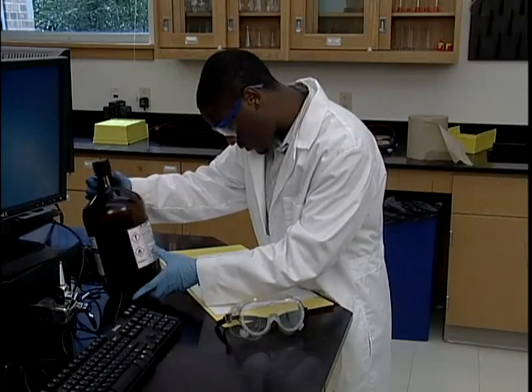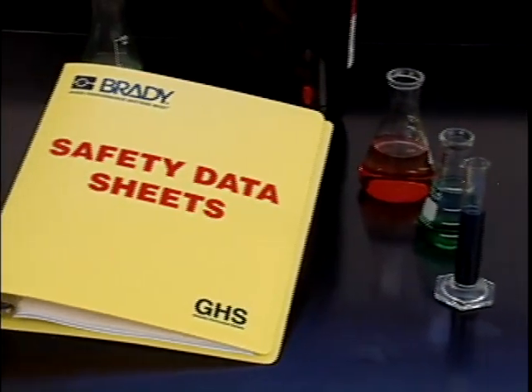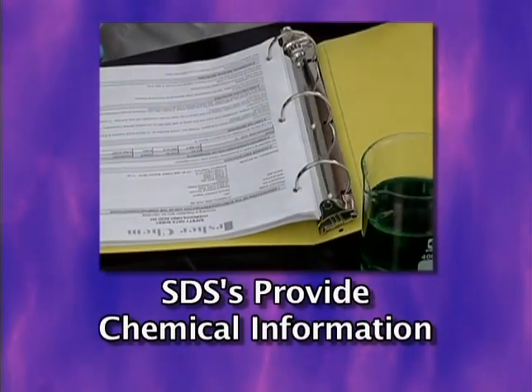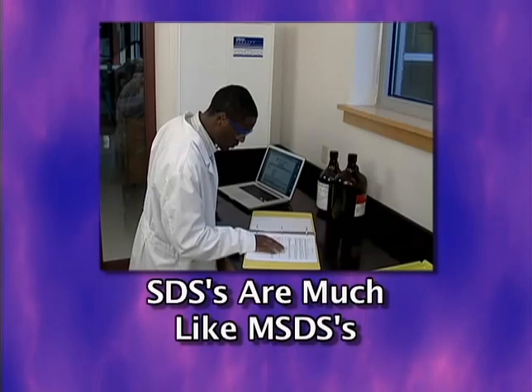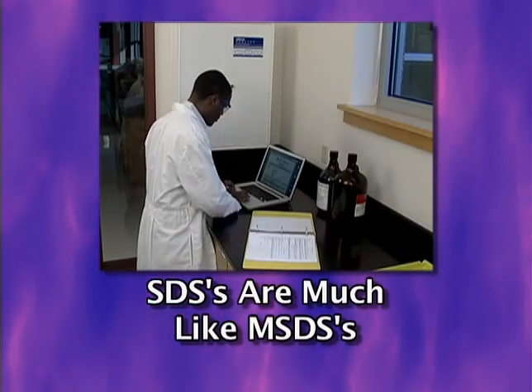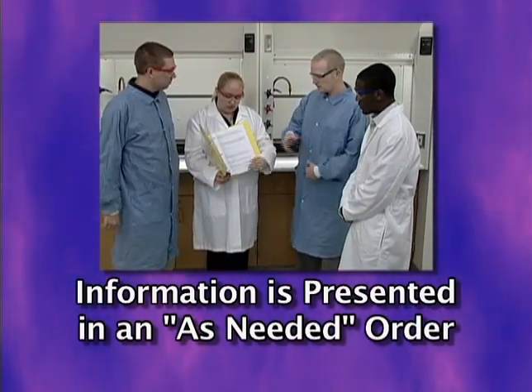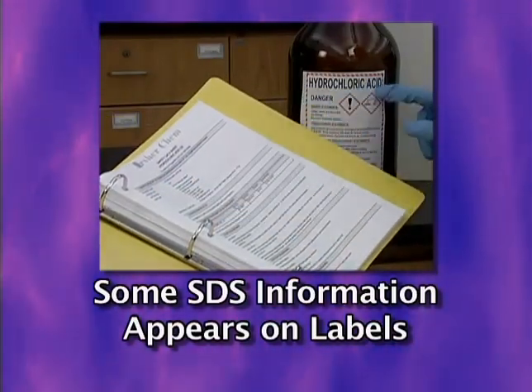There's a lot we need to know about the chemicals we work with, and safety data sheets are where to go to find it. Let's review. GHS safety data sheets provide information about the chemicals you work with. SDSs are organized much like an ANSI MSDS and contain much of the same type of information. The information in an SDS is presented in an as-needed order. Some of the information from an SDS also appears on a chemical's container label.